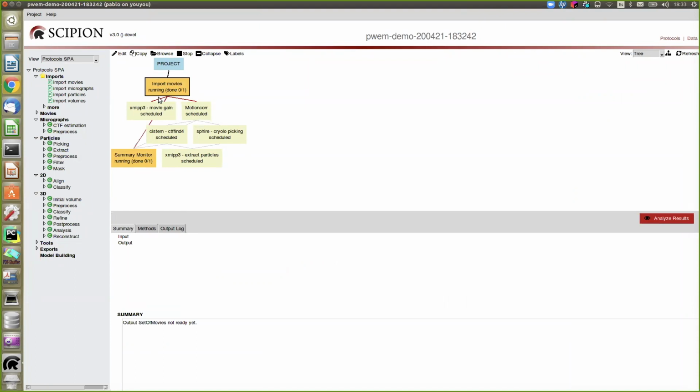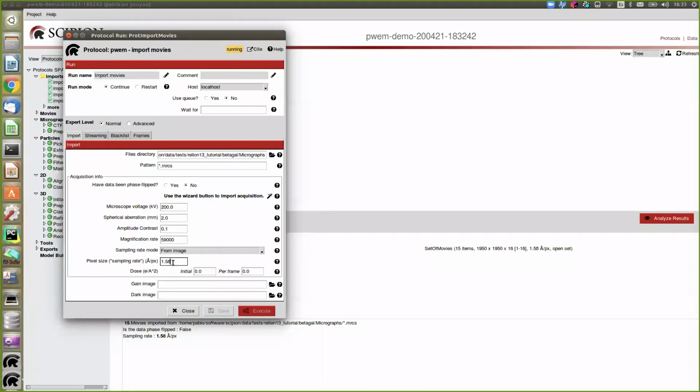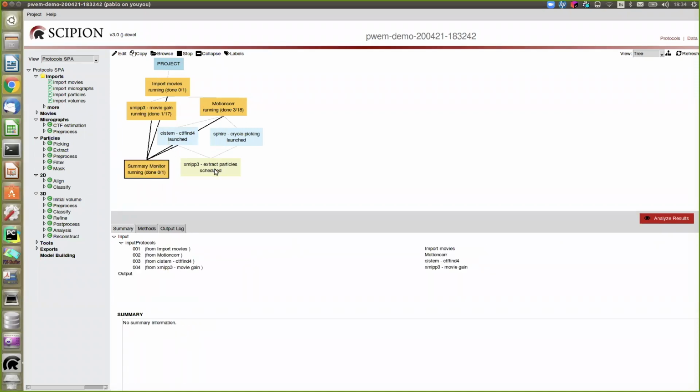So with that template, the values I enter are now in one or several of those boxes. So the voltage ended up here. The sampling rate ended up also here. And basically my template was this, and is actually now working on the streaming.